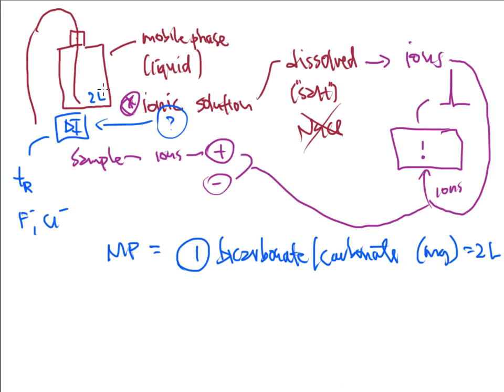So what you're seeing is that we are putting ionic species in a mobile phase. It is breaking up. We are getting some charges that are assigned to those milligrams of bicarbonate and carbonate, but they are super, super tiny, super small amounts. And those really teeny tiny amounts are going to be very easy for us to clean up at the end of this process when it comes to the detector. The bicarbonate and carbonate, these ions that get released: for the bicarbonate, this is an HCO3 minus, and for the carbonate species, it is a CO3 minus 2.